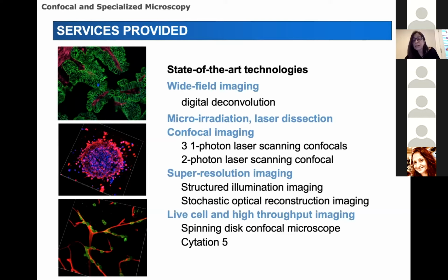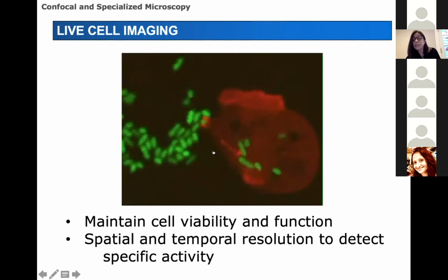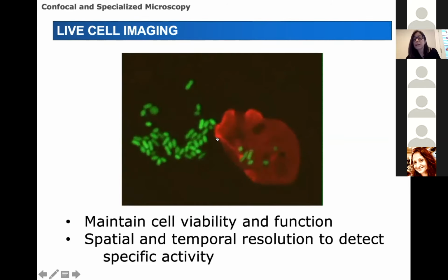And today, what I'd like to talk about are some of the instruments that we're using for live cell imaging. Now, what you're looking at, or we'll see, is a classic live cell imaging movie, which shows you a macrophage moving towards and taking up pathogens and then degrading those pathogens in the lysosome. So to orient you, the pathogens are shown in green fluorescence. Here you can see the macrophage, and the red fluorescence is actin within the macrophage. And what I trust you can see is the actin at the leading edge of the cell as it moves towards the pathogens. You can see these phagocytic cups that are coated with actin at sites of pathogen uptake.